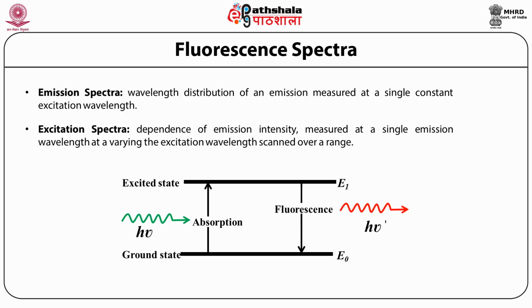For most fluorophores, the quantum yields and emission spectra are independent of excitation wavelength. As a result, the excitation spectrum of a fluorophore can be superimposable on its absorption spectrum.